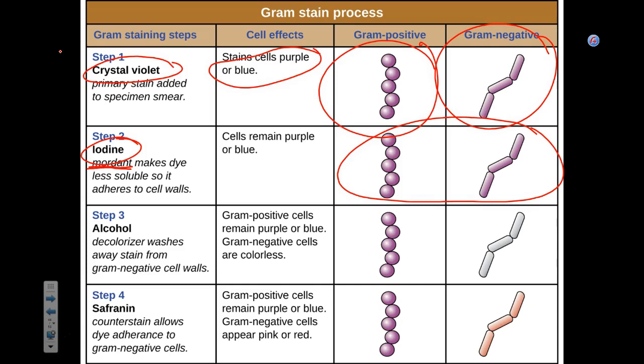So it sticks really well to the gram positive. Yeah, but gram-negatives, not so much. And then you wash it away. You add alcohol. This is the most important and the most tricky step. What alcohol does, it is a decolorizer.